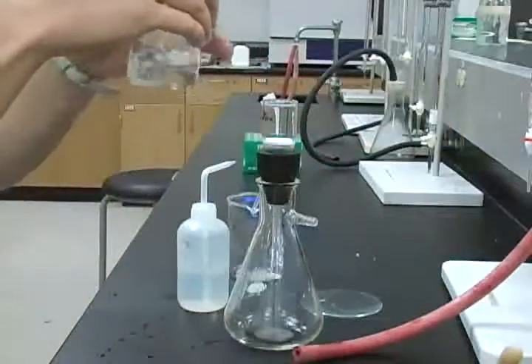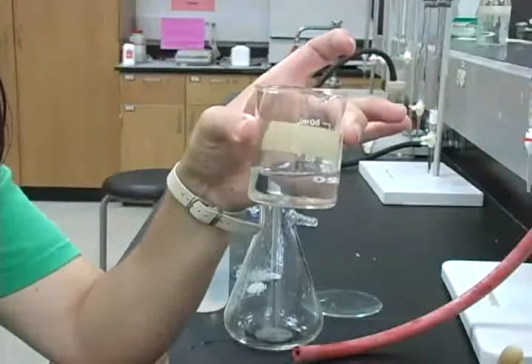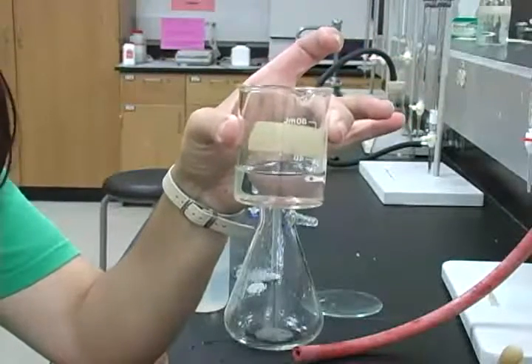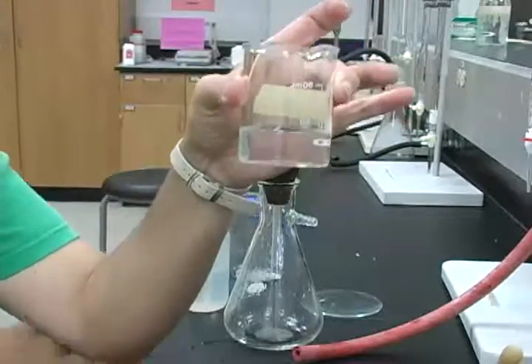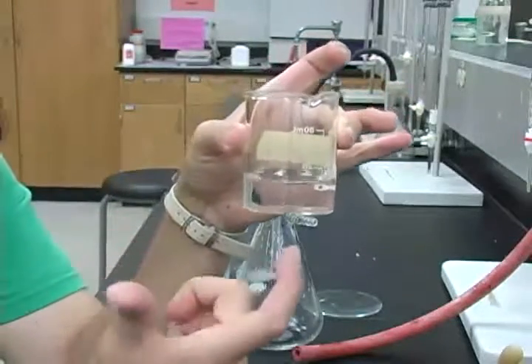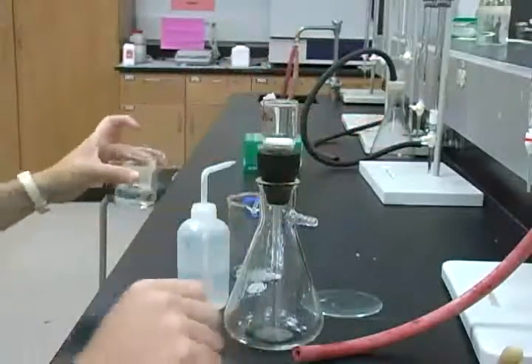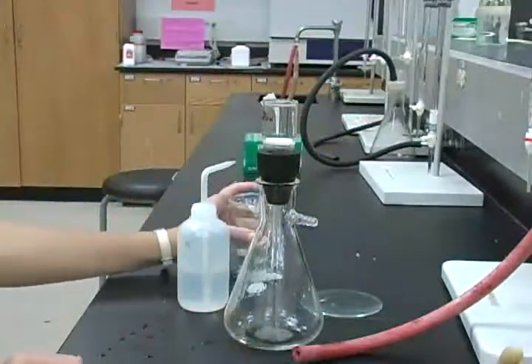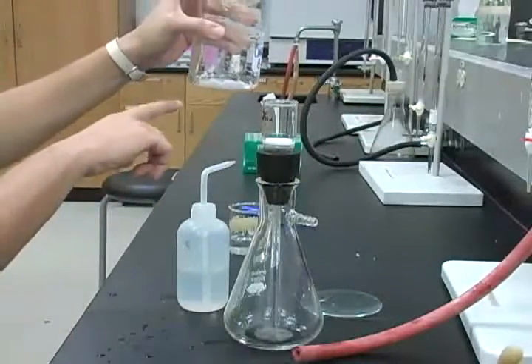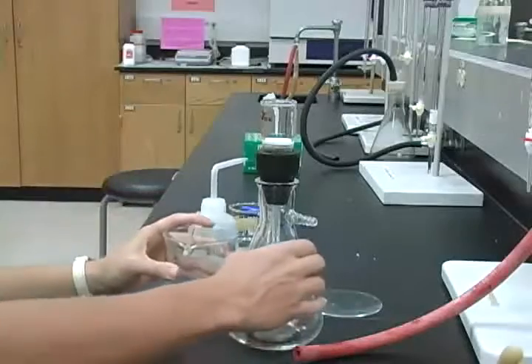If this mixture turns cloudy, you need to continue filtering or washing the precipitate until it no longer tests positive for silver ion. If it comes out clear, like this mixture is, then that means your precipitate is free from silver ion and you're now ready to complete the transfer from the beaker into the crucible.